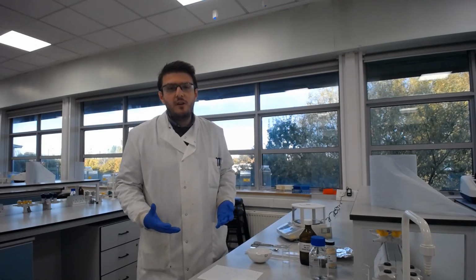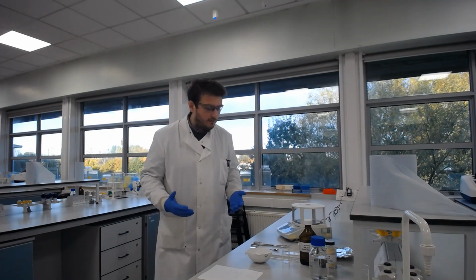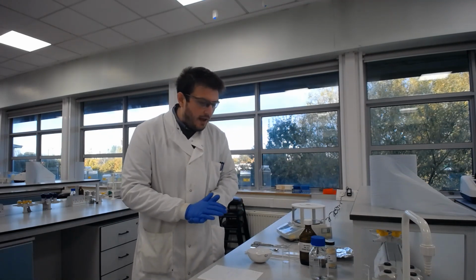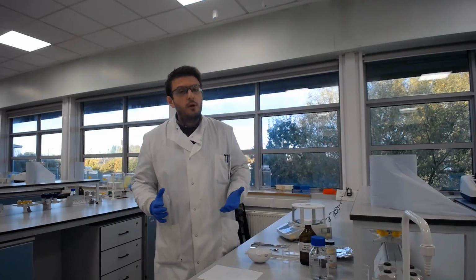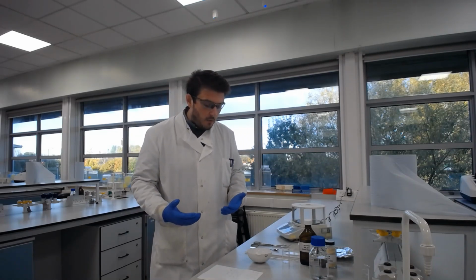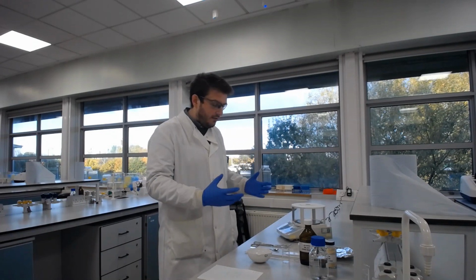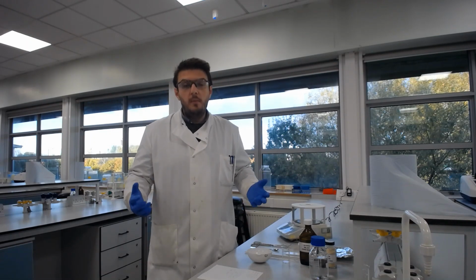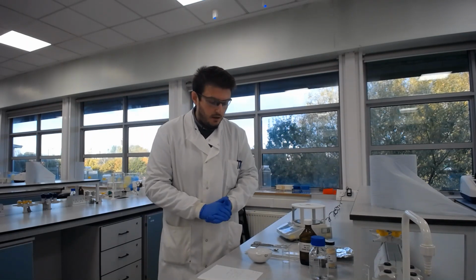It's very much just like making a jelly at home, except in one of the most difficult molds that you've ever had to use. So you've got a lab learning pack as well, and on there that's got some directions for what you need to do and some other bits that you need to do yourself. But what you need to get to before you actually start making the suppositories is to have a formula, or a recipe, that you're going to use.